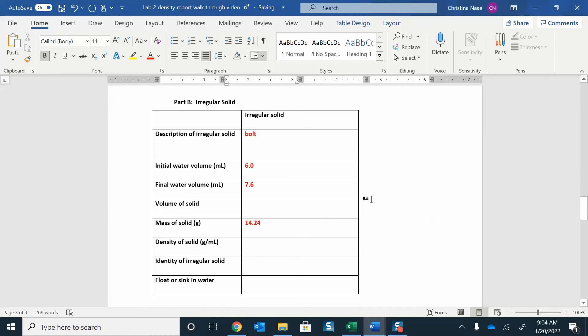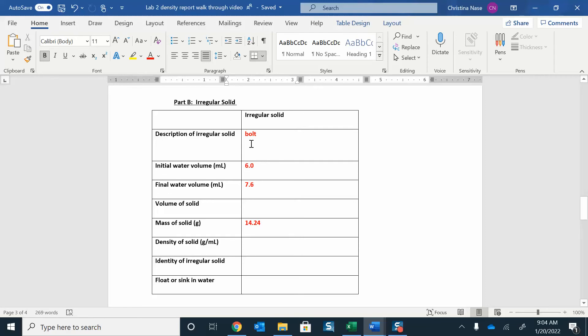For the irregular solid, it's a little bit different. You're going to do this by volume displacement. There will be a bunch of different irregular solids. Irregular just means it's not going to be a cube or a rectangle or a cylinder, it's going to be something else. I had a bolt that I tried.